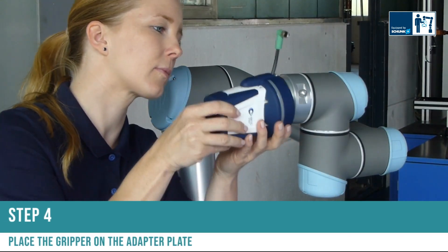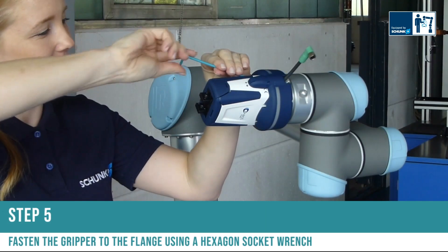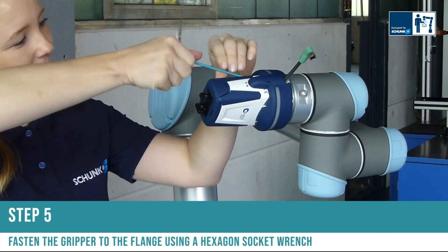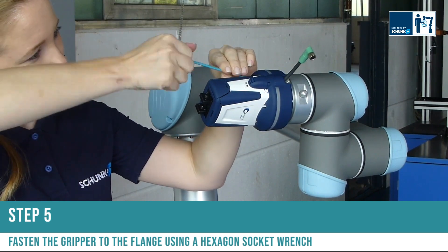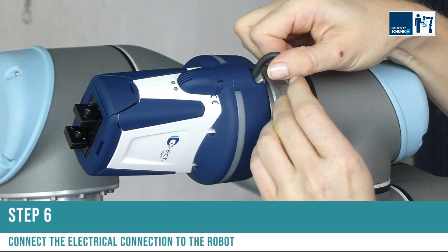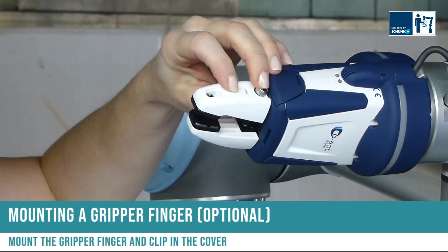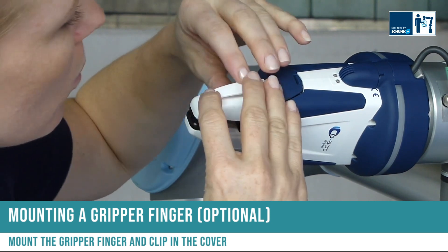Step four: place the gripper on the adapter plate. Step five: fasten the gripper to the flange using a hexagon socket wrench. Step six: connect the electrical connection to the robot. Optional: mounting a gripper finger — mount the gripper finger and clip in the cover.